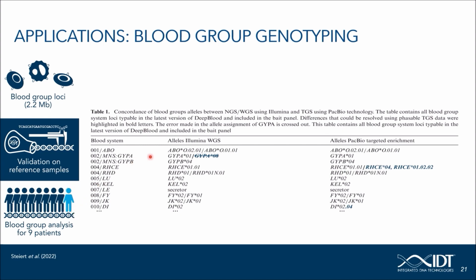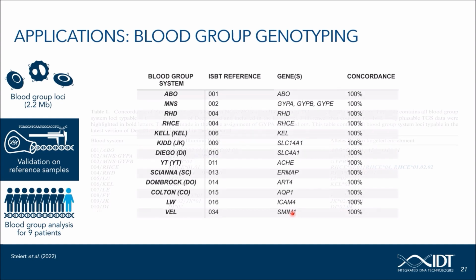1 patient from this cohort was genotyped via NGS as well as via targeted PacBio sequencing. In 3 cases, we could refine or even correct the respective blood group allele reference calls determined by next-generation sequencing through the PacBio long-read data. The blood group phenotypes determined by array genotyping for the other 8 patients were perfectly concordant with the phenotypes determined by long fragment target enrichment.